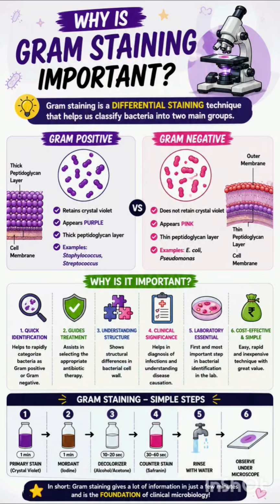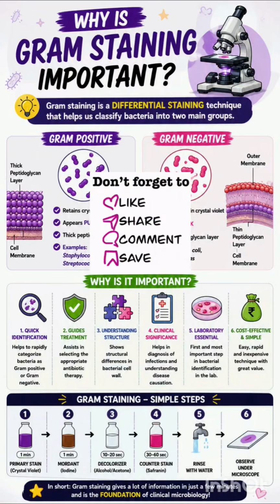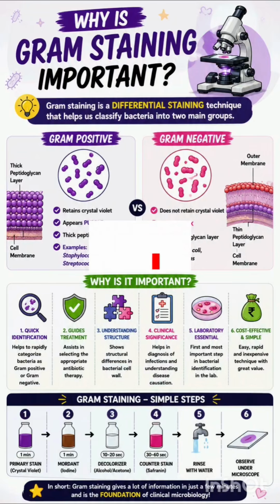Gram staining is a very important and basic technique in microbiology and pathology labs. It is also important to learn why it is important, on the basis of viva questions and also for the practical knowledge of microbiology. So let's start.